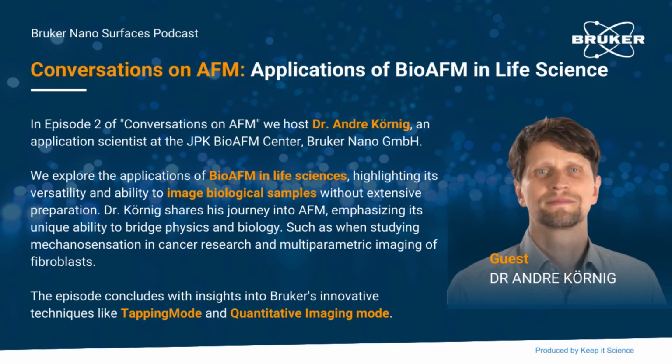Yeah, the common things are probably mechanical analysis. Mistakes in sample preparation are a bit what I said. I just recently had somebody who wanted to measure some bacteria. That's why I was saying with the swimming around, they didn't fix well to the surface, so they would just start swimming off while we were touching them. Actually, this was also an issue during my PhD, where I started with some magnetotactic bacteria, trying to measure them, and it was kind of impossible to keep them there for sufficient time to measure them.